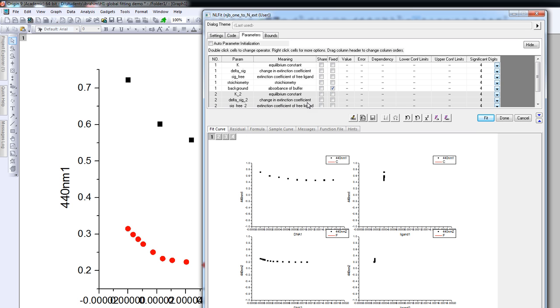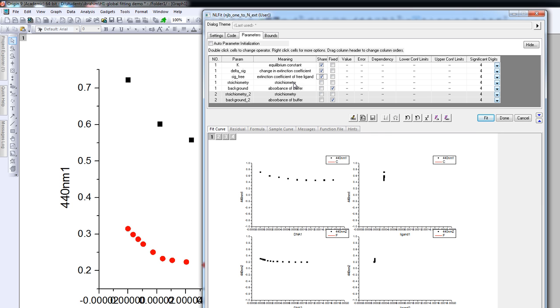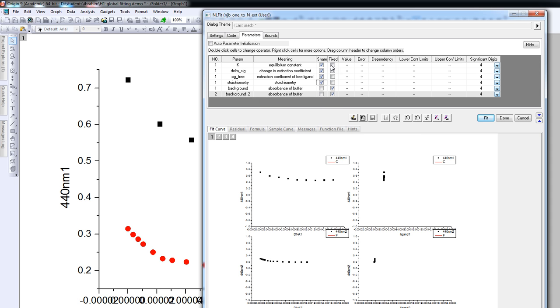Because we are looking at absorbances at 440 nm, there are a few parameters that we can share. Both titrations should correspond to the same equilibrium constant, so we share that parameter. Because both datasets are at 440 nm, the extinction coefficient and the change in the extinction coefficient should also be the same. If you analyze datasets at different wavelengths, you cannot share these parameters. The stoichiometry shouldn't depend on the titration, so that is also shared. The only parameter that is different between the two titrations is the absorbance of the buffer — the background signal — so those are fixed, not shared.